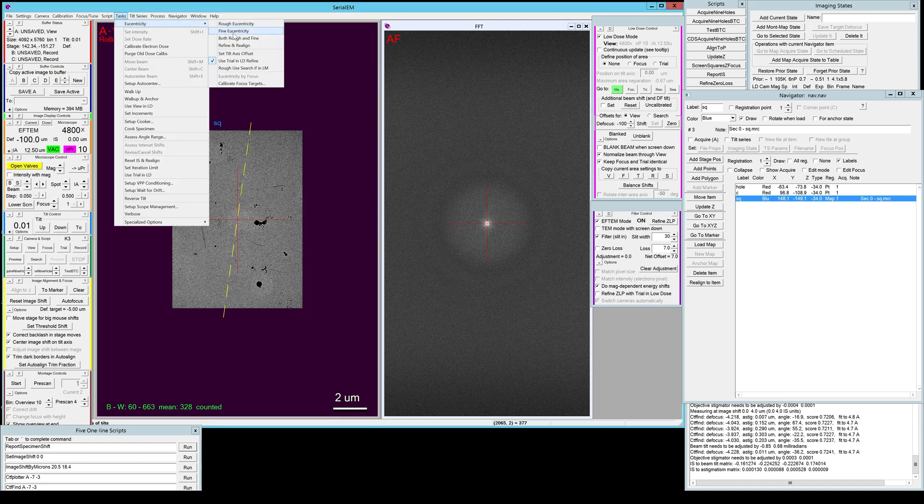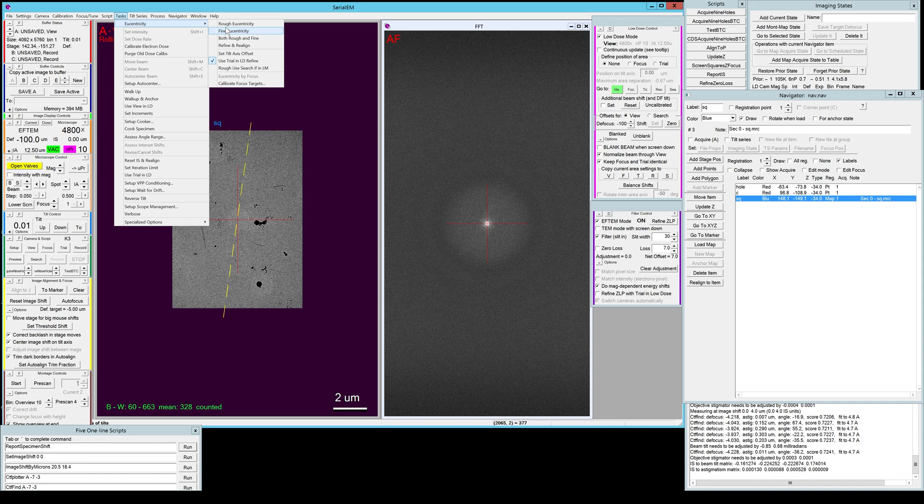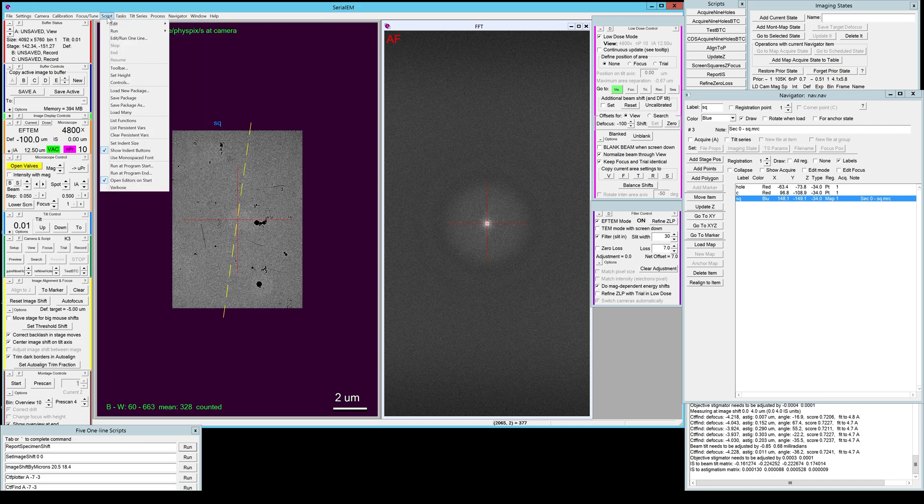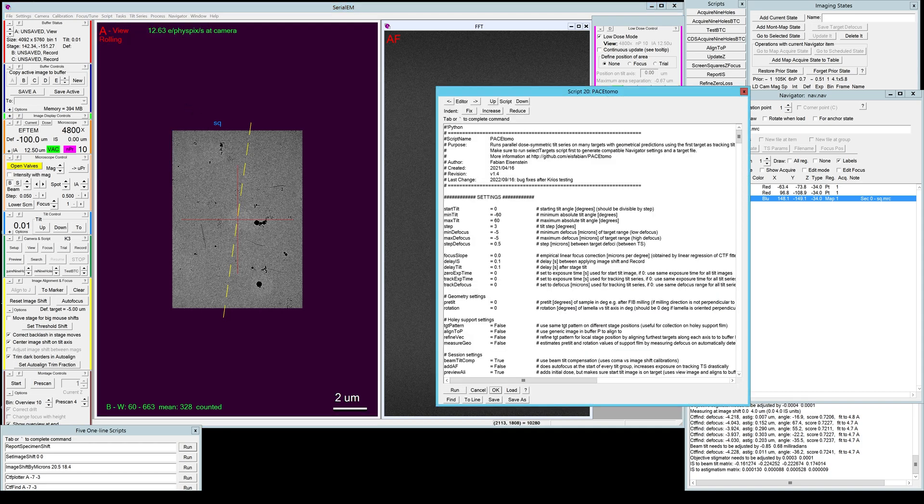SerialEM has a defined eucentricity routine to determine the tilt axis offset by lateral displacement, however this is not really a good value to use with PACE TOMO because the lateral displacement is quite well predicted. The bigger problem is the displacement in Z, so the focus that you have to adjust.